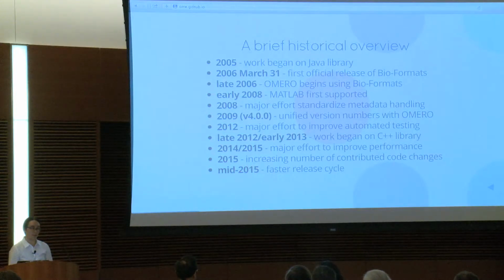Prior to this, metadata was stored almost exclusively in what we call the original metadata table, which is a free-form and highly format-dependent hash table. We still provide this as a supplement. Again, some of you saw this morning, but we don't really recommend this as a standard way of accessing all of your metadata. This set of changes also served to bring Bio-Formats fully under the OME umbrella alongside the OMERO project.